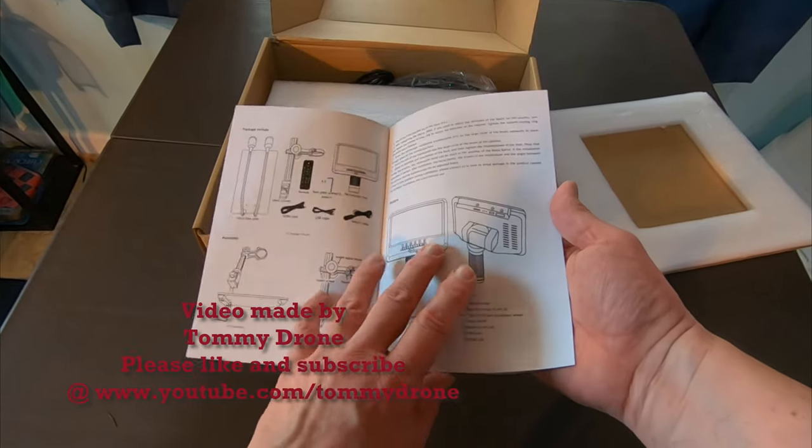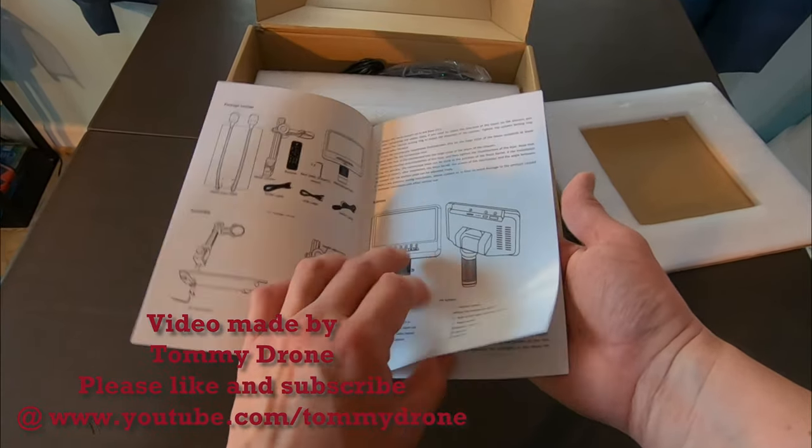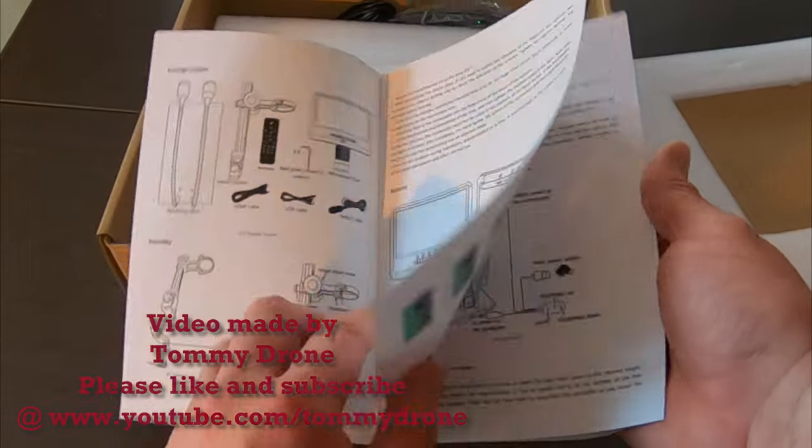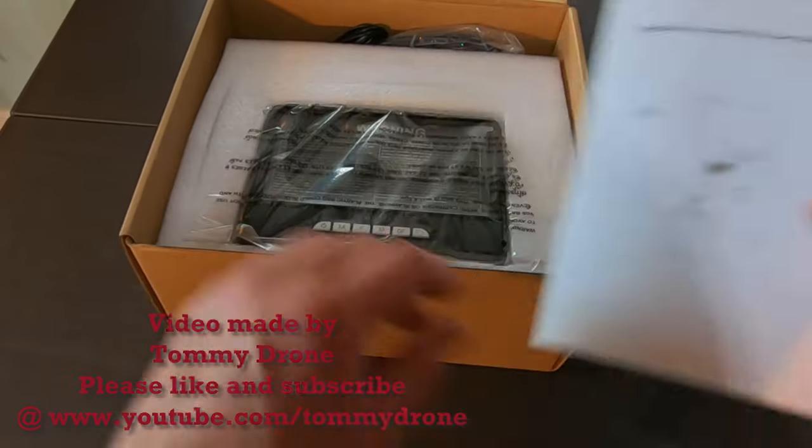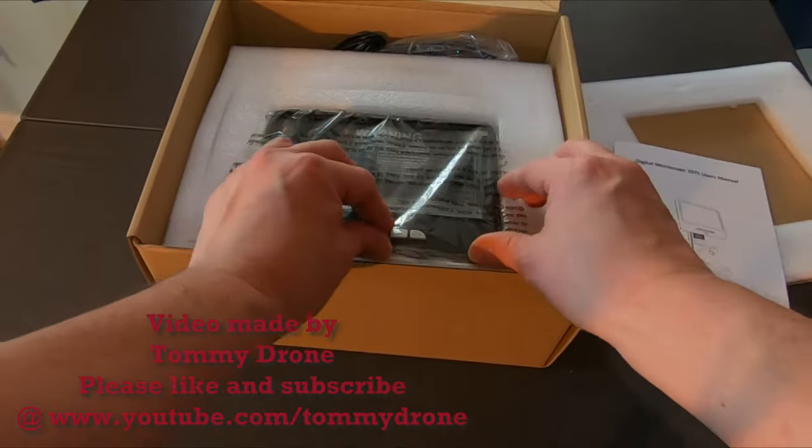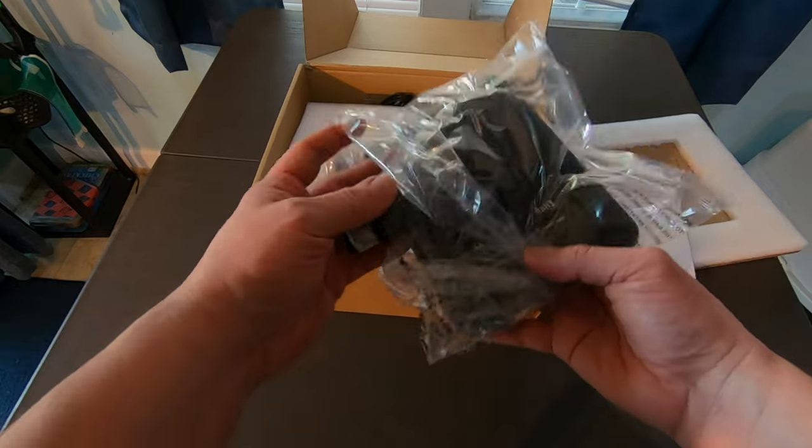So it comes with everything you need, including your display, the microscope, and even remote control. Wow. This is going to be really good.